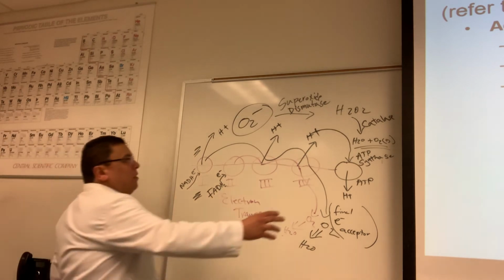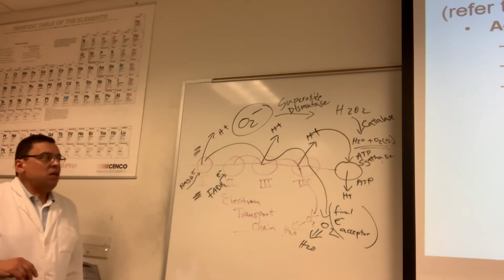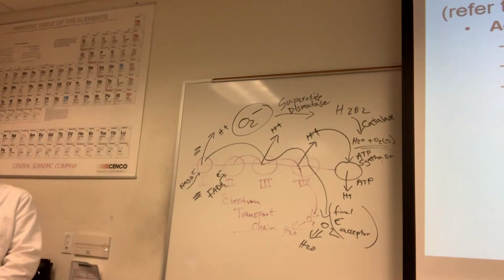We're doing this lab here. We're gonna have two bacterial species, and you're gonna figure out which one produces catalase and which one doesn't. A very simple lab.